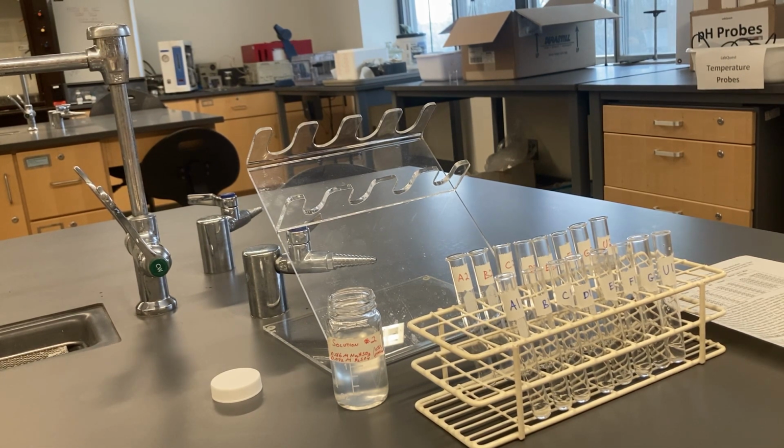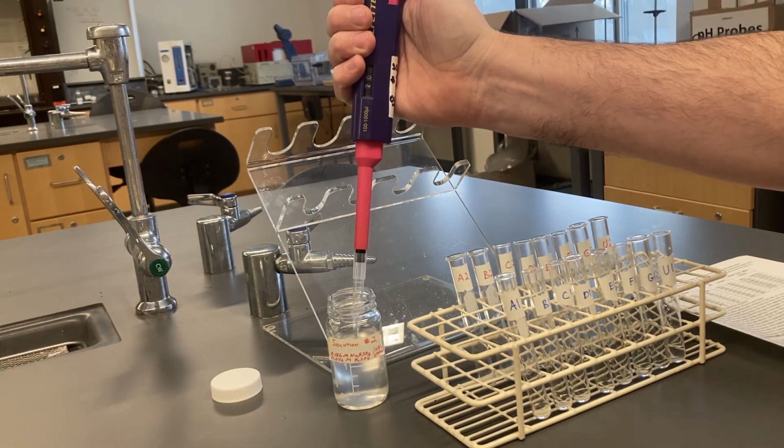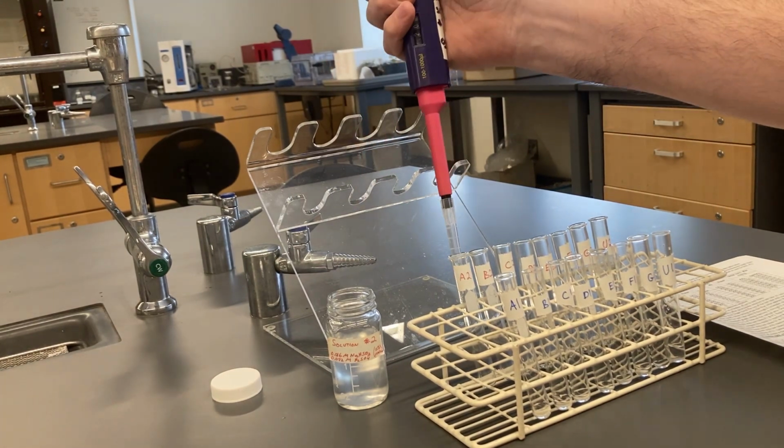Now, this is the second solution, so this has the sodium bisulfite, and it's got sulfuric acid, and it's also got 2% starch in it as an iodine indicator. So I'm adding 200 to A2.